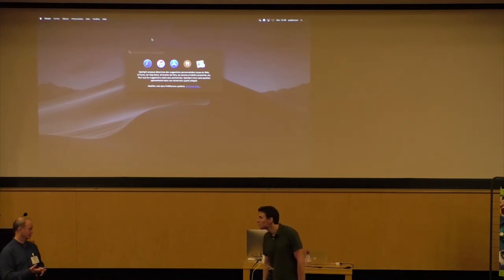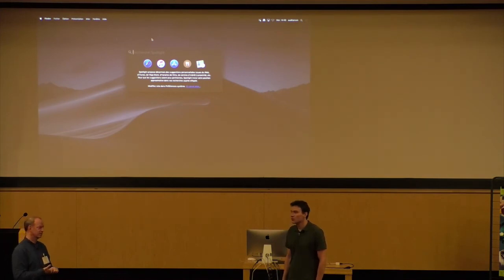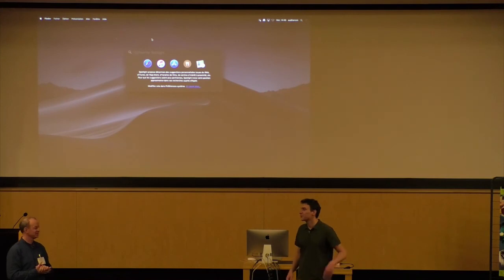How is the ethane condensed actually? Do you control the temperature for that also? By Peltier, normally by Peltier elements. And do you measure it also? Yeah, I measure it. I have several sensors in there for measuring grid temperature, air temperature, humidity, temperature of the capillary. There are many sensors in there.